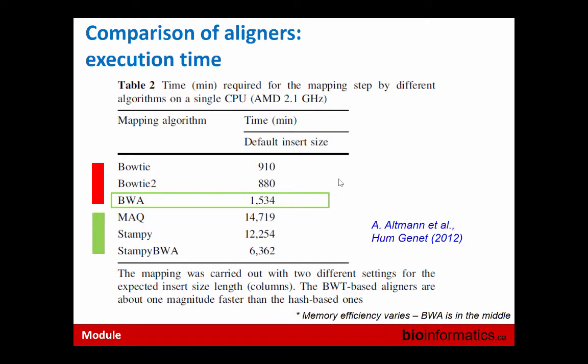Then you learn some aligner, and you don't want to jump from aligner to aligner, in particular if in your analysis you use multiple sets of data, you would like to use the same aligner. For example, when we use our data and would like to compare with some published data, we realign it with BWA using exactly the same parameters. Yes, Bowtie 2, I use Bowtie 2. It's a good aligner now, and many people are using it. It's kind of 50-50. It's actually a little bit faster than BWA.